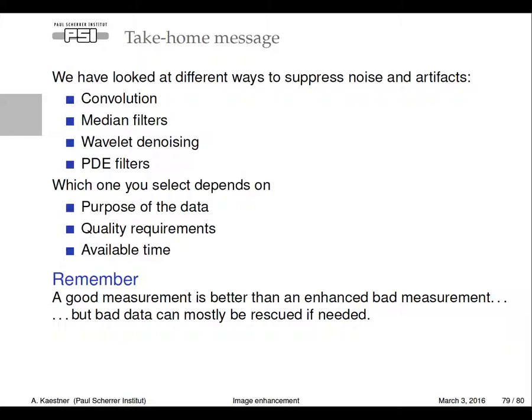And very important, no filtering process can replace a good measurement. We can actually rescue data which are not so good, and sometimes during the experiment we want to push the limits, but then there are methods that can take care of the data. So, thank you.